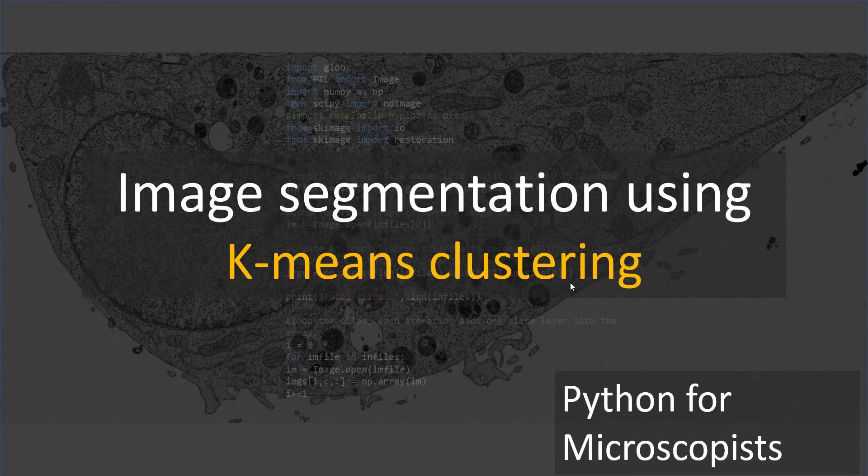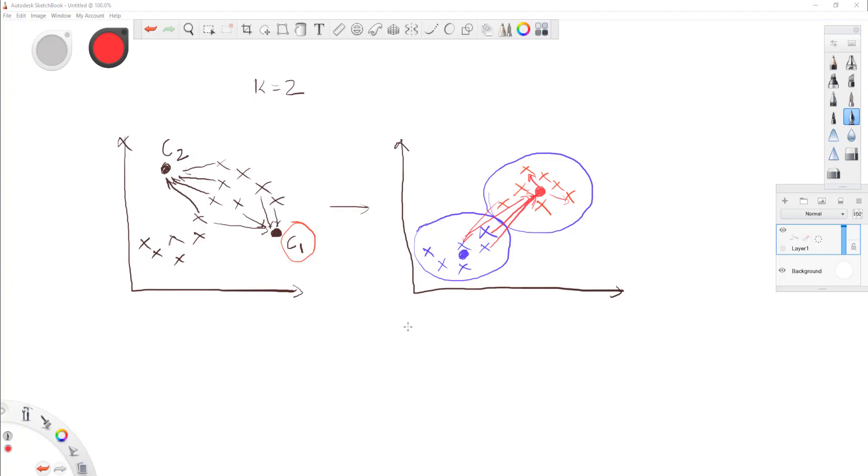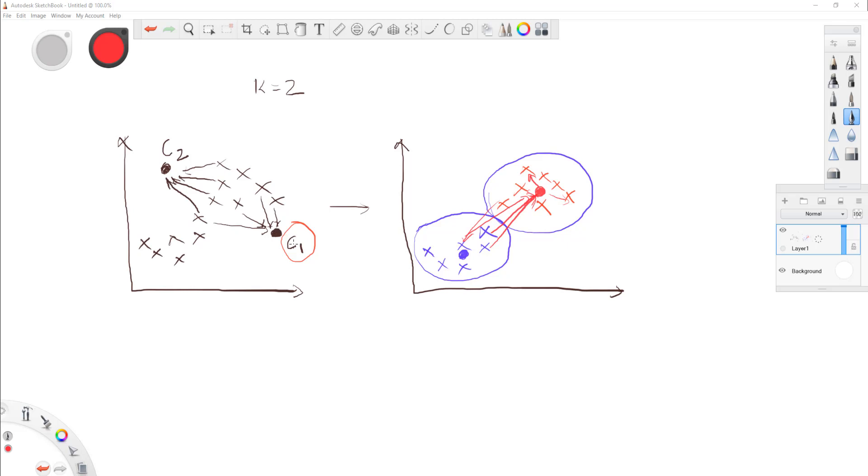Just to remind you what k-means is all about, you have a bunch of data that's scattered around, like pixel values. These on the low end represent one type of phase or class in your image, and the high pixel values represent a different class. Initially, the algorithm assigns random seeds and calculates the distance to each of these seeds from every data point. Based on how close it is to a given seed, it assigns a label to that data point. All the red ones are clustered together, all the blue ones are clustered together. After a few iterations, we'll find the seed at the centroid where it's not moving anymore.